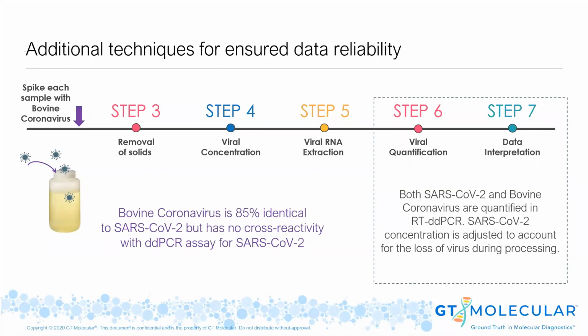Additionally, the variability from 2 to 14% is huge. To put this into context, if a sample varied from 2 to 14% from day to day, you could have as much of a 7-fold change in signal just because of the method alone. Going from detecting 100,000 viral copies per liter of wastewater to 700,000 copies per liter overnight would be enough to raise some big red flags for a potential outbreak. So this source of variability must be controlled.